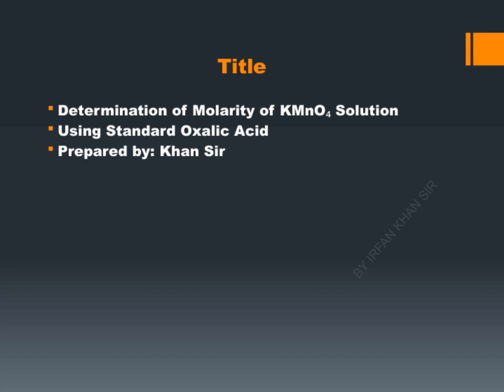And of course, this method highlights the importance of titration techniques in quantitative analysis, which is a fundamental aspect of chemistry. This technique will help you understand how to determine unknown concentrations effectively.